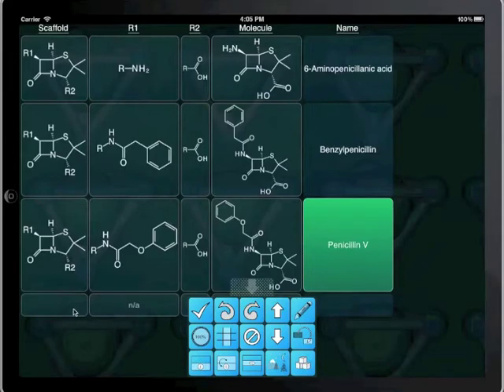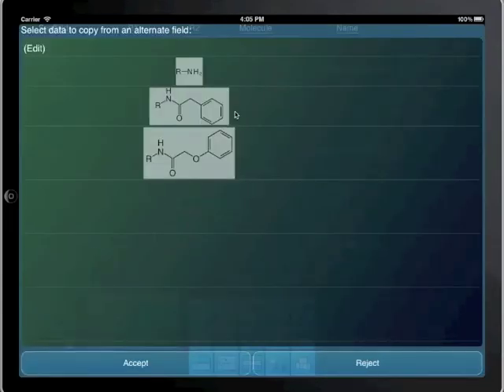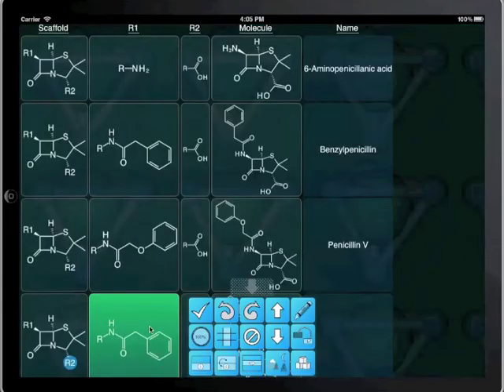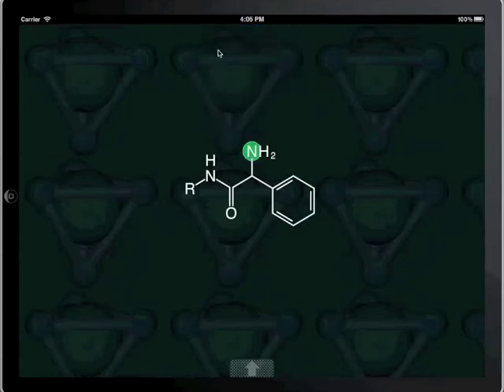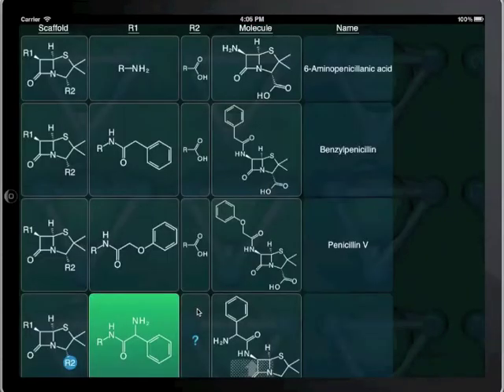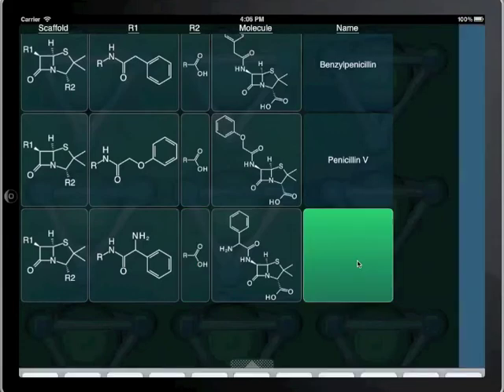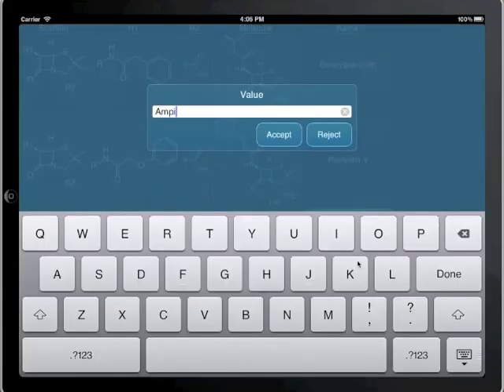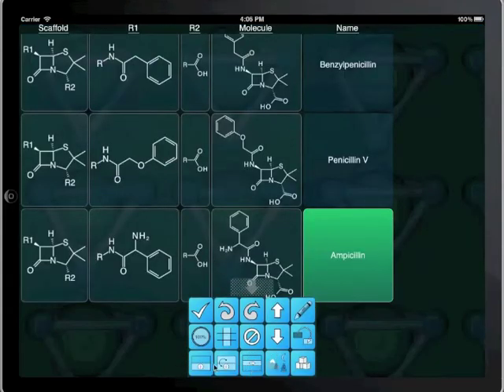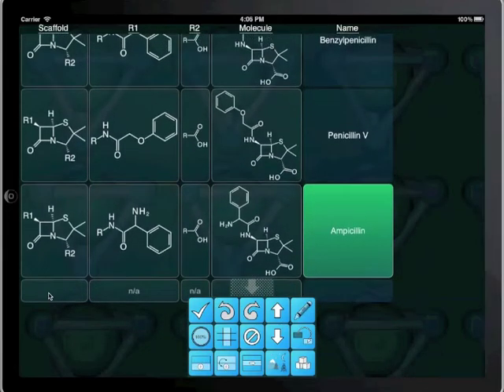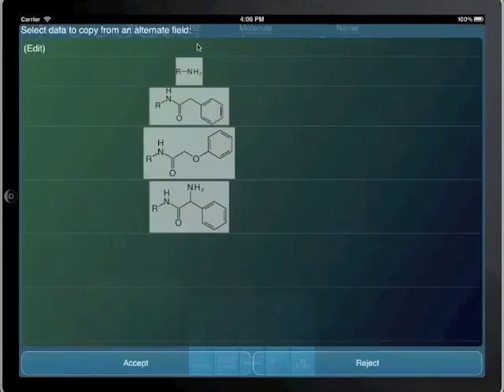For the fourth row, we copy the scaffold, and then we copy the value of R1 from a previous value and use it as a starting point for modifying. For the fifth row, the value of R1 is quite a different fragment, so it's easier to draw it from scratch.